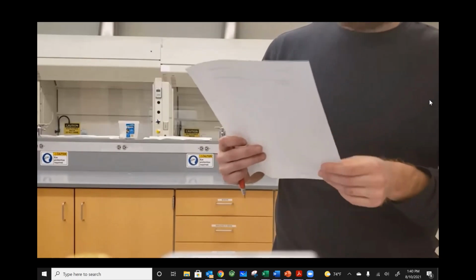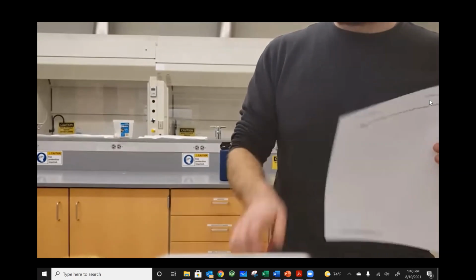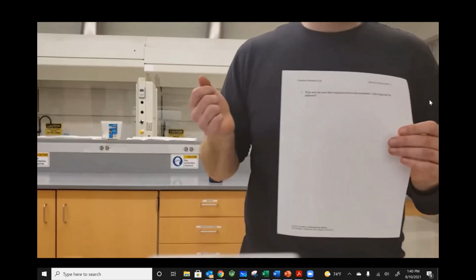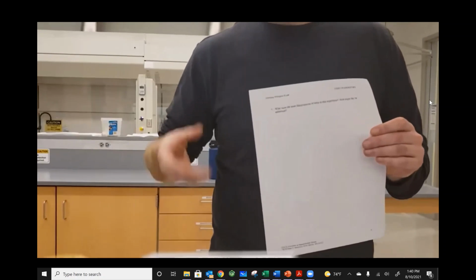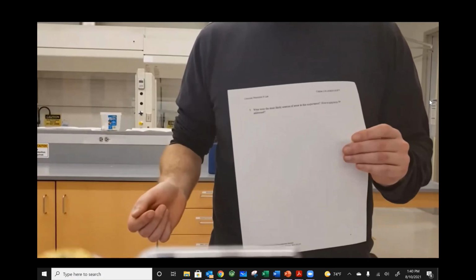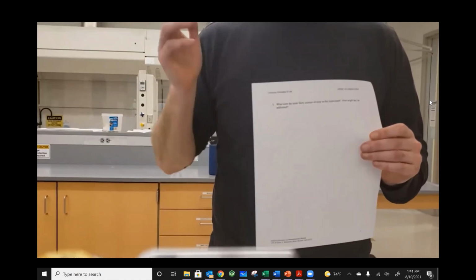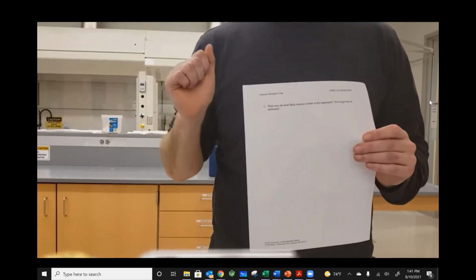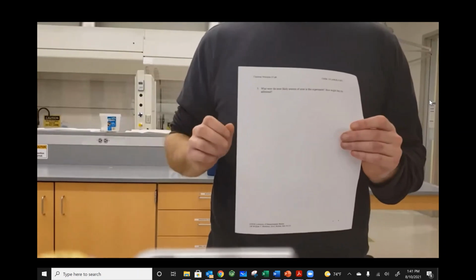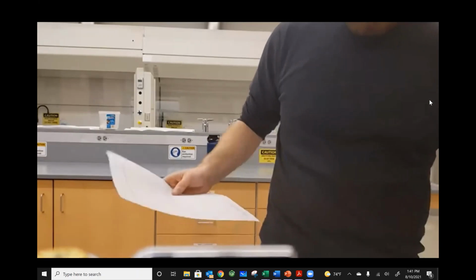And then for question 3, list the likely sources of error. As I said, when I was agitating the room temperature samples, my hand was holding the test tube and applying body heat to it, which was more than the room temperature. Proper agitation is very hard to achieve, so even though I was vigorously shaking it, it was not as optimal as it could have been. Agitation in the varied temperature reaction chambers was more difficult, so I wasn't able to agitate as thoroughly. Those should be your sources of error, and that should include everything you need.